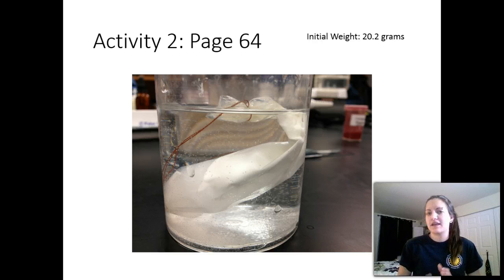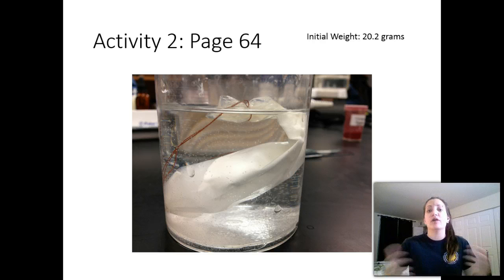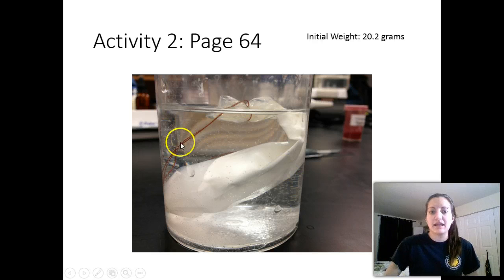So we're going to let it sit here for about 20 minutes, and at the end of this, we're going to test, did any of those particles move outside of the bag? So did any of the particles that were in here move into the surrounding water?